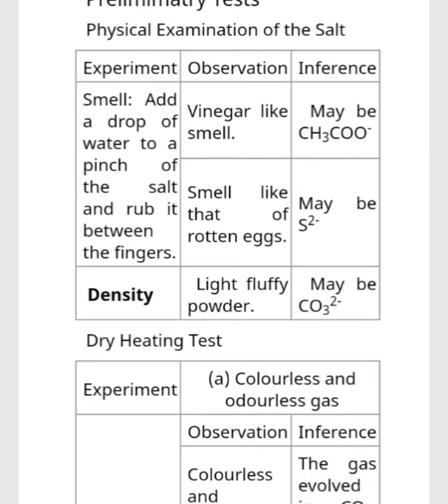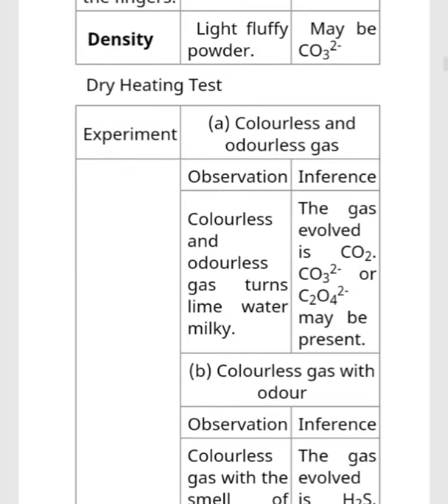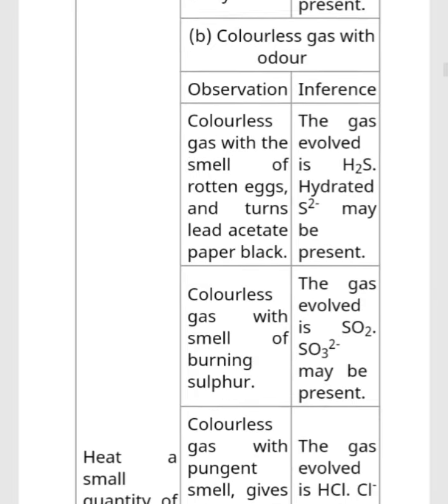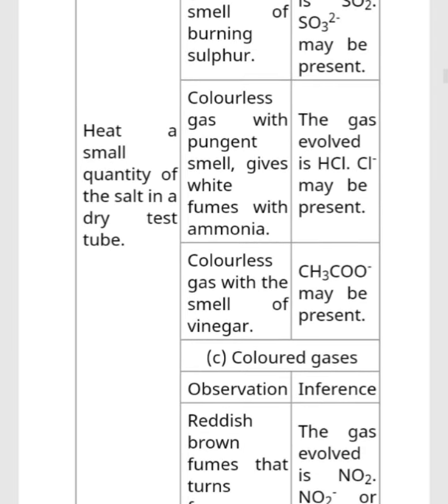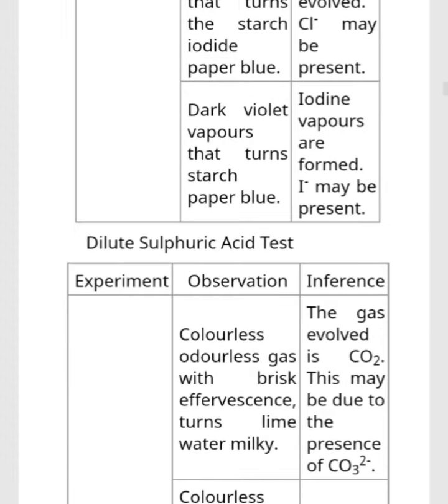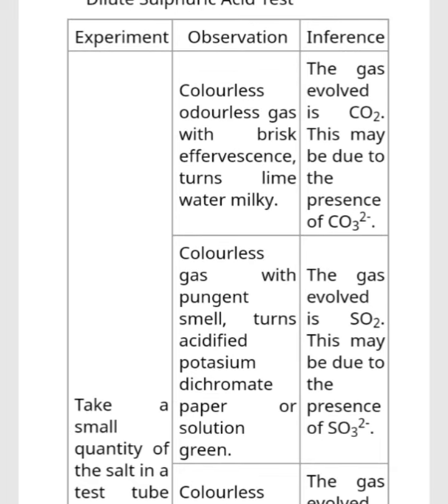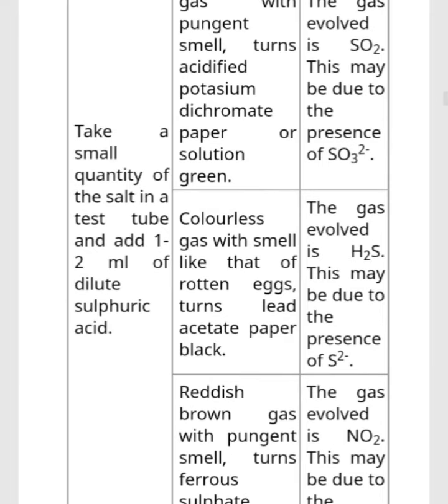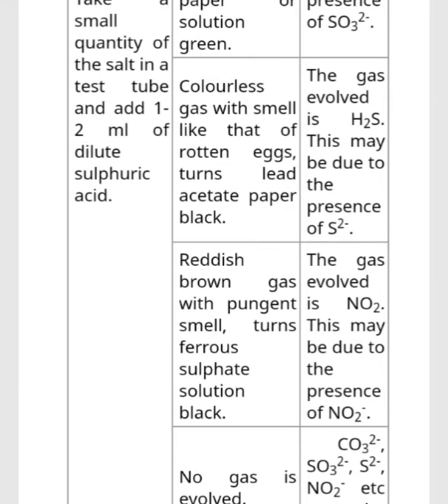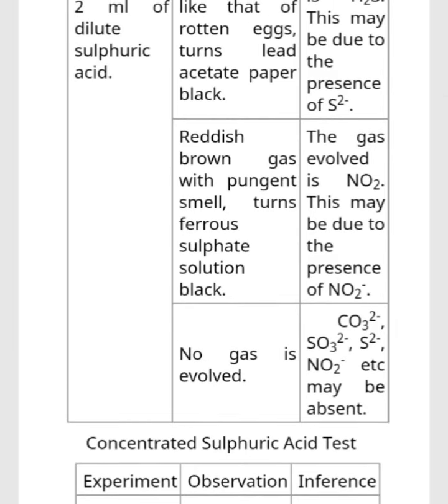So I hope you have gotten the actual idea here. Let me just show you again so you see it. You can pause the video, check, pause the video, then check. Just note the color and odor, the smell and their color. Very, very important. Lime water turning milky, lead acetate paper turning black, ferrous sulfate solution turning black, and the rest: also note them. They are very, very important.